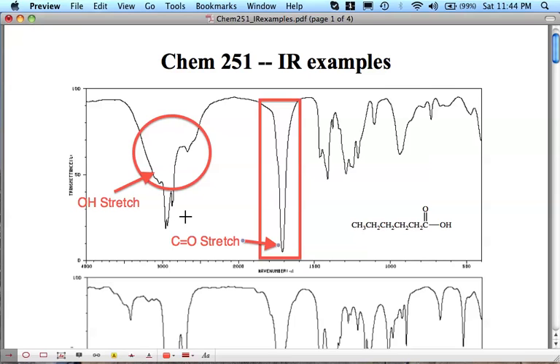These sharp peaks coming out? Yeah, that's the CH stretch. And you see those in almost all organic molecules, so it's not really too exciting to note them, but we can do that. Put a little arrow pointing out those peaks. Okay, so we've done a nice job of annotating the major peaks in that spectrum.